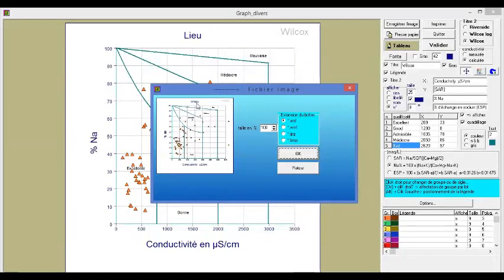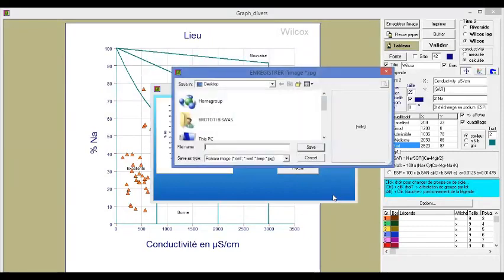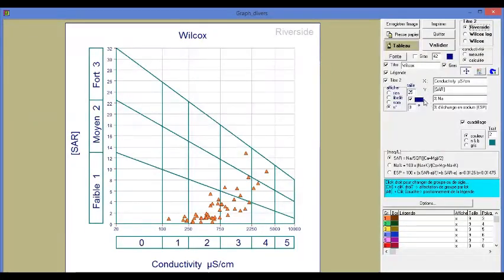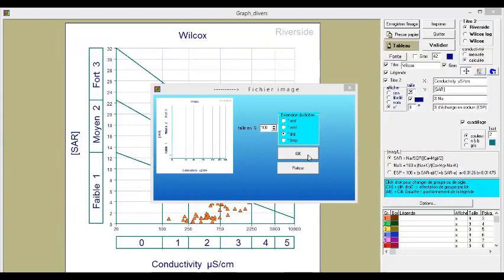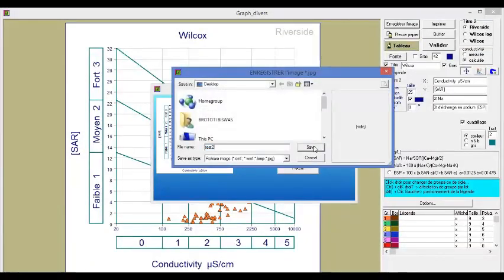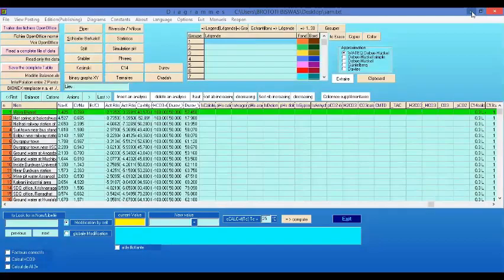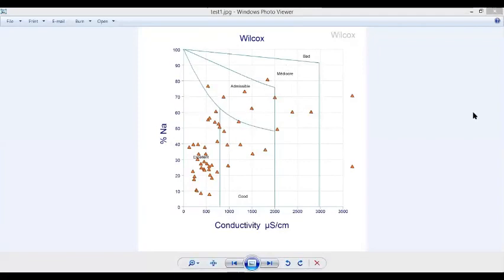The software will ask in what format you want the diagram published. Select JPEG format, type a filename such as 'test one', save it to the desktop, and click OK. The saved image will show everything in English — the title as Wilcox, conductivity, and the updated category labels — confirming the changes worked.